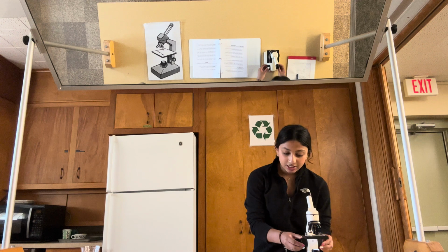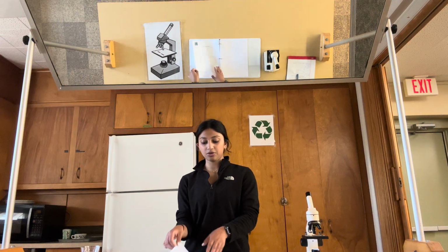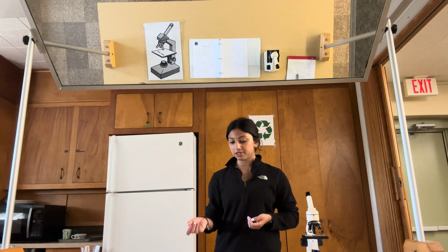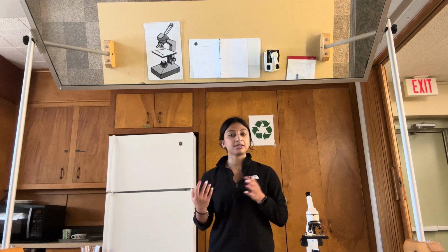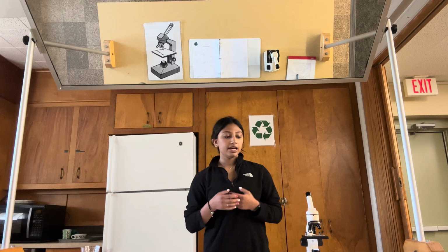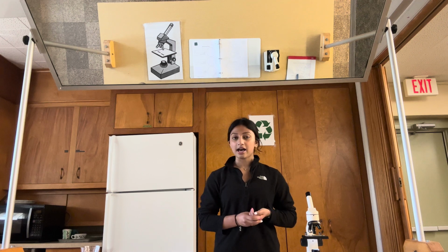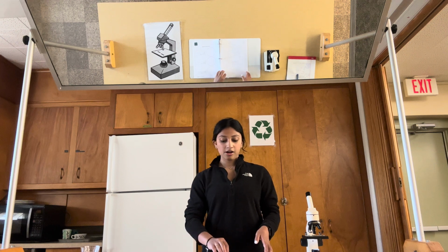Okay, at each station in the booklet, the students will have the opportunity to record their observations by drawing what they see at various magnifications and what's going on. They will be able to do this at every single station and record their observations.